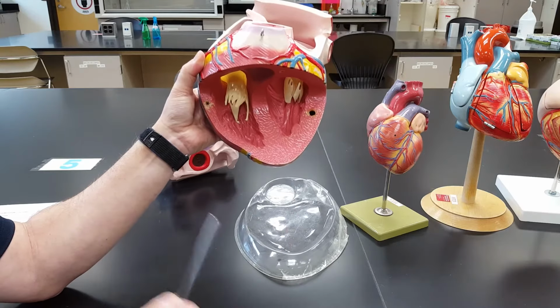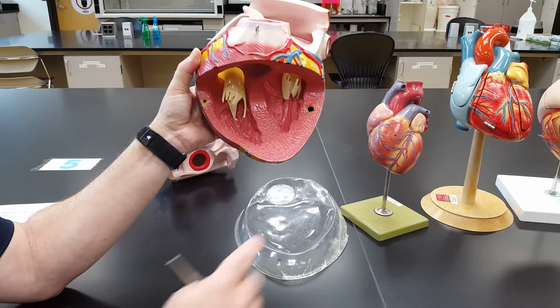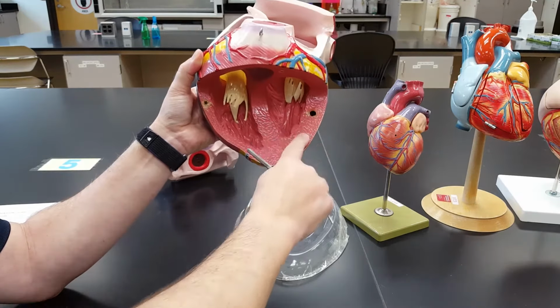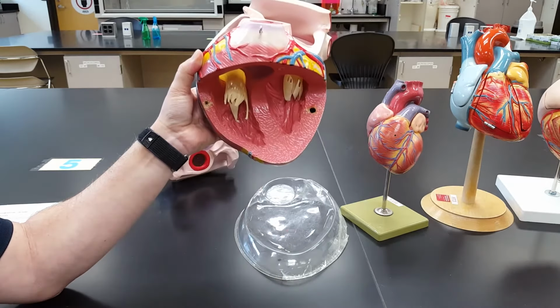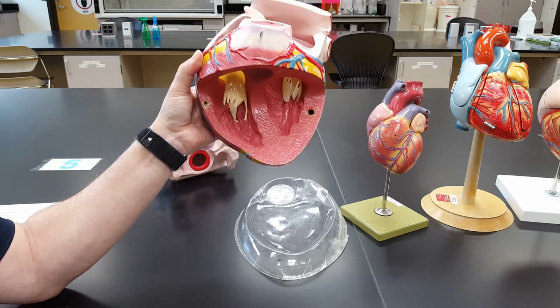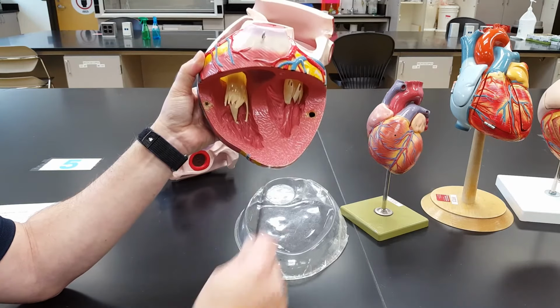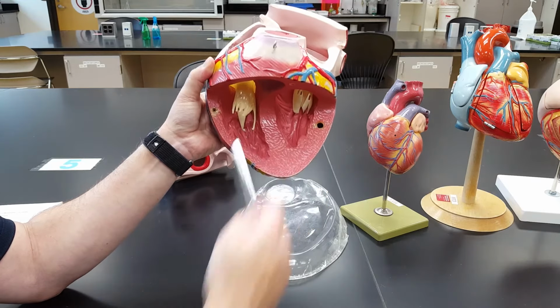Notice on this model, I already mentioned it, and it'll really help you out with the sheep heart dissection. The left lateral ventricular wall is always much thicker than the right ventricular wall. It's a way to orient yourself whenever you see a heart model or a heart dissection. So left ventricle, right ventricle.